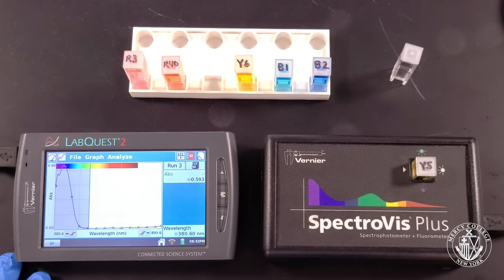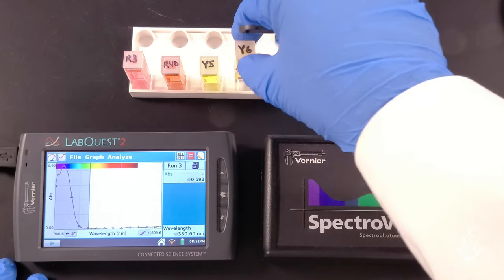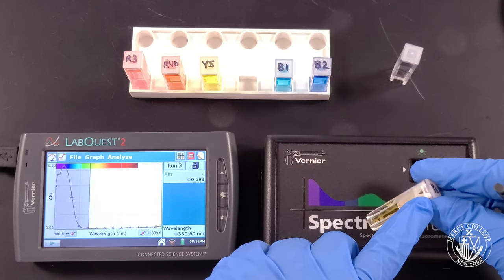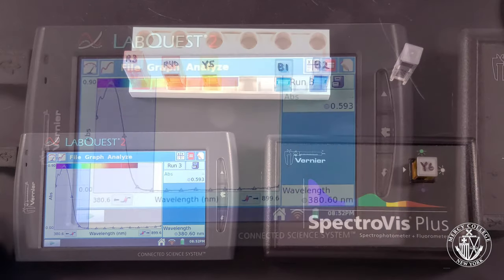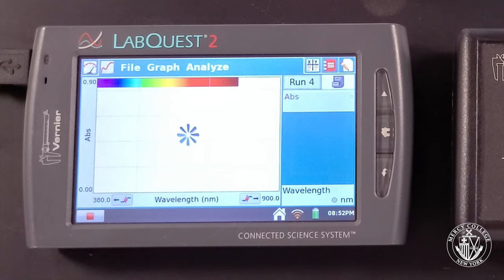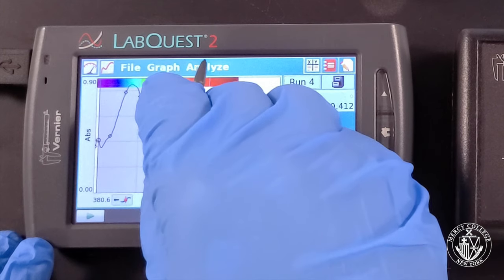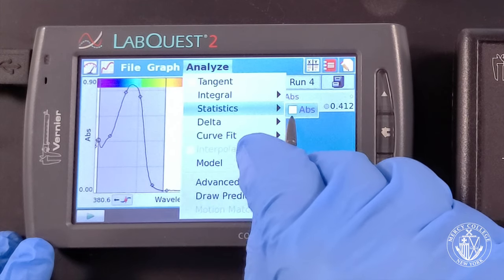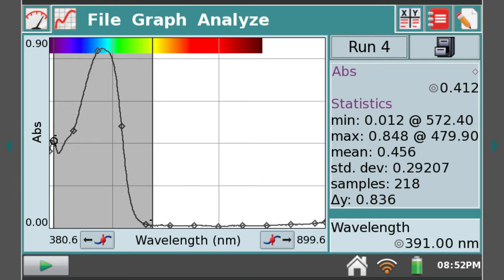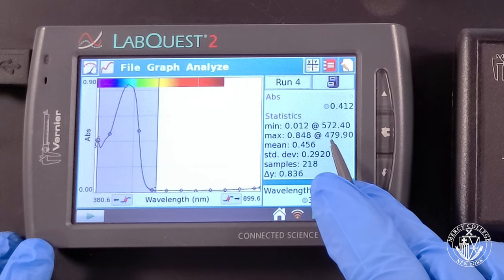Again clear your statistics and prepare to analyze another sample. Repeat the same analysis procedure for each of your remaining dye standards. Here we see that this dye sample also absorbs in the blue-violet region of the spectrum. The dye appears to have a maximum absorbance of 0.848 at a wavelength of 479.9 nanometers.